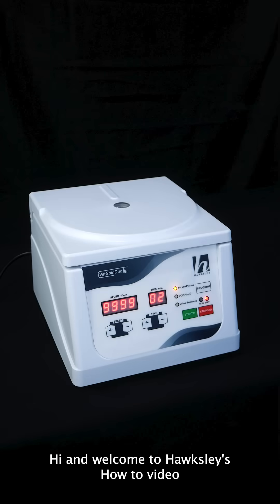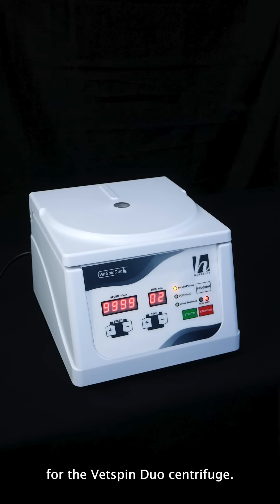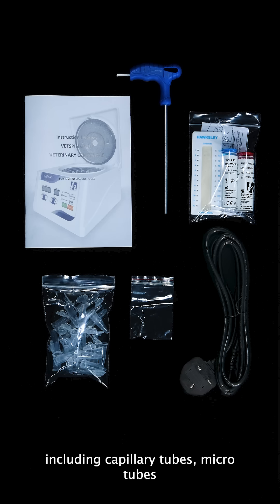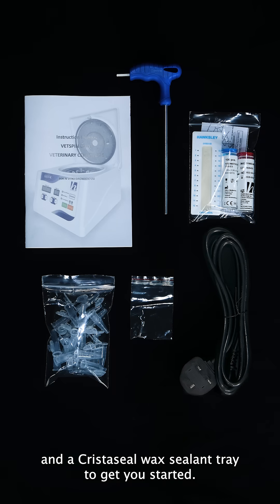Hi and welcome to Hawksley's how-to video for the Vetspin Duo Centrifuge. The Vetspin Duo comes with a range of accessories, including capillary tubes, microtubes and a crystal seal wax sealant tray to get you started.